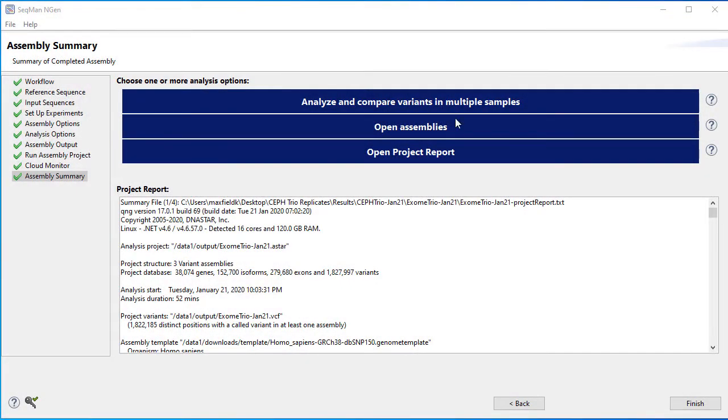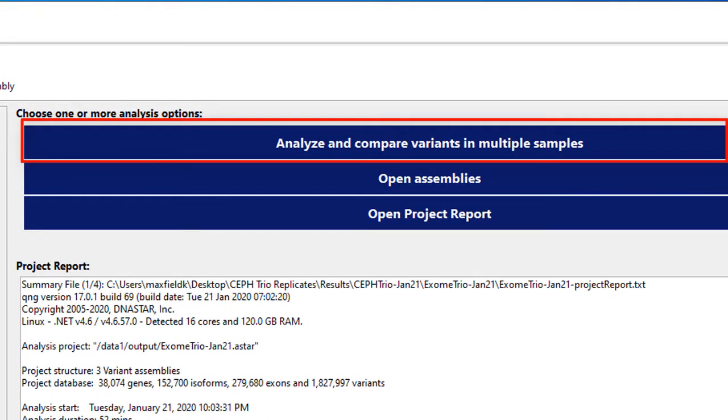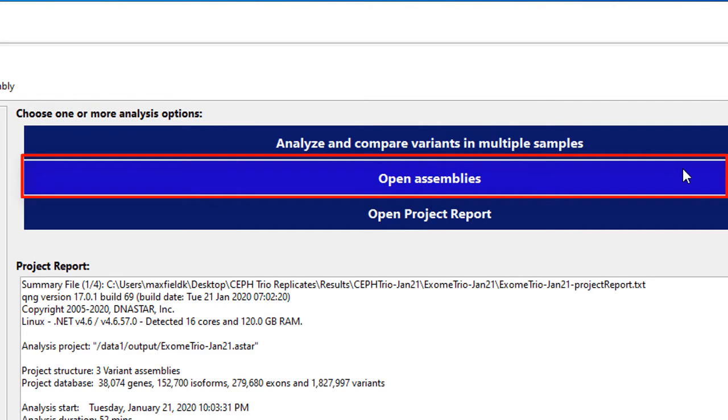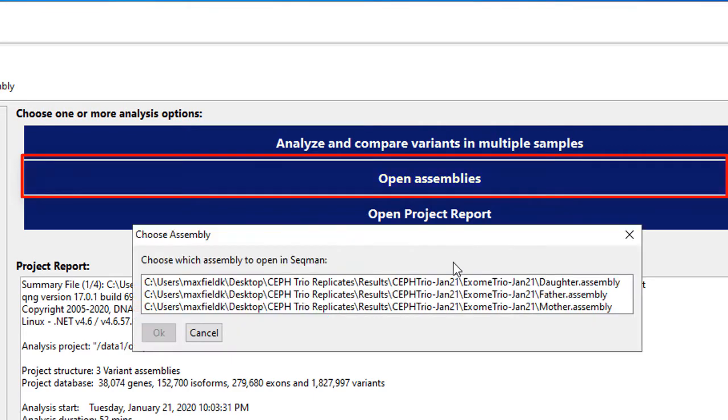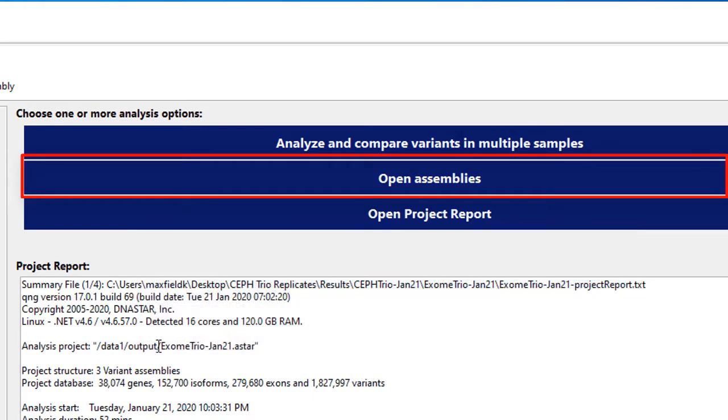After assembly, files will be saved to your local computer. You can then analyze and compare variants in multiple samples using ArrayStar, or open assemblies for each sample individually in Seekman Ultra to view assembly coverage, read alignment, and variance.